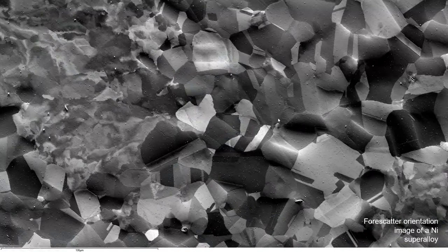And here you can see that there's a large number of grains which are recrystallized with twins, and you can also see a region over towards the left with a more mottled appearance. This is some strained regions, so this clearly is a partially recrystallized piece of material. And this image is obviously a great prelude to performing EBSD, because you can already see what's going on in the structure to help you decide whether this is a good spot or not for your analysis.